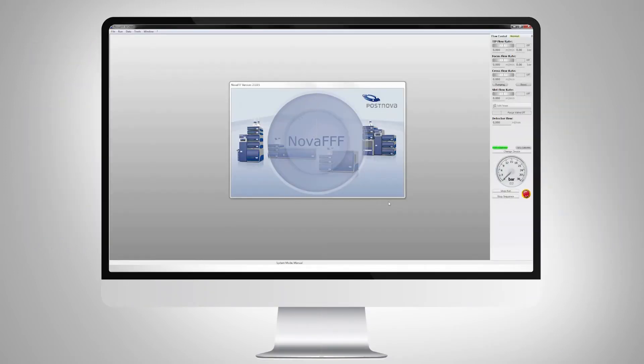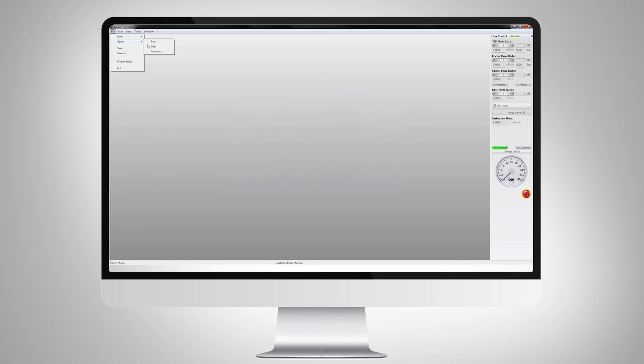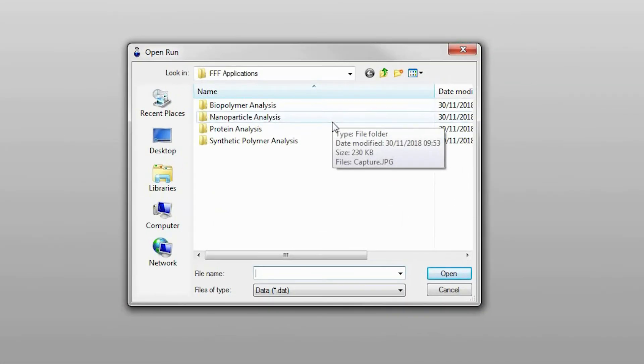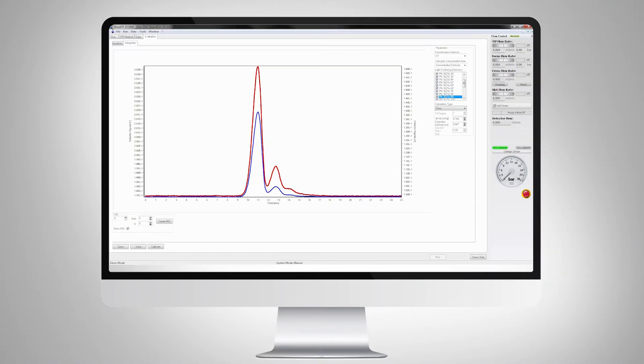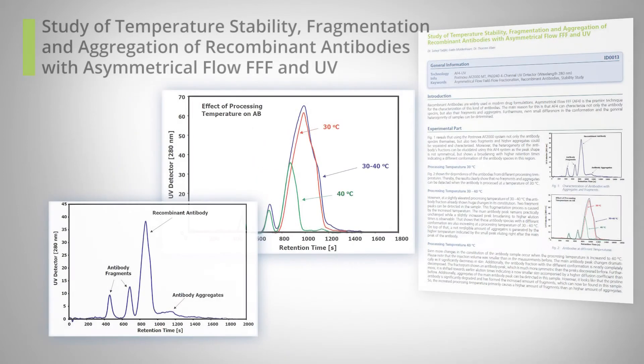The AF2000 has a very wide application range and the flexible software allows full analysis of even the most complex samples. For proteins and peptides, the separation capability allows both oligomeric state and aggregates to be quantified.